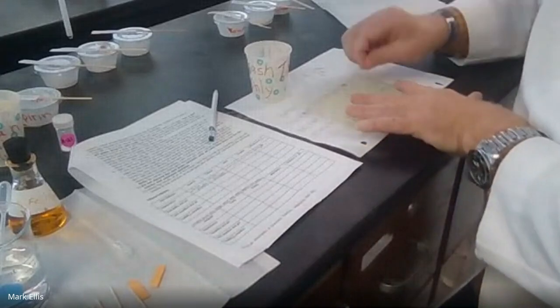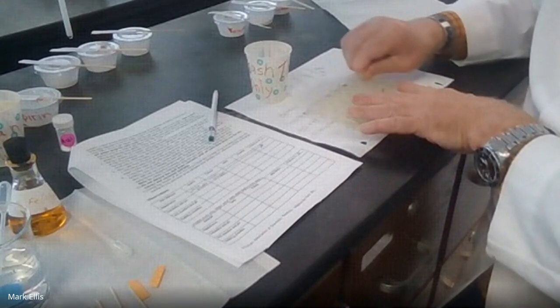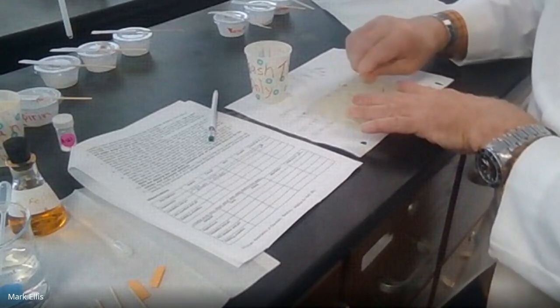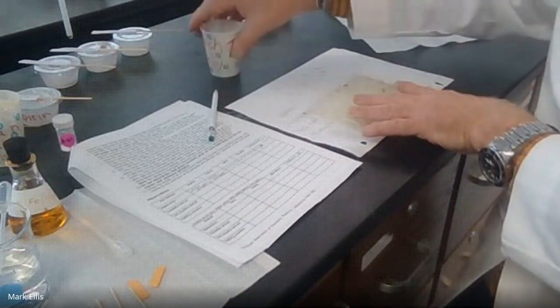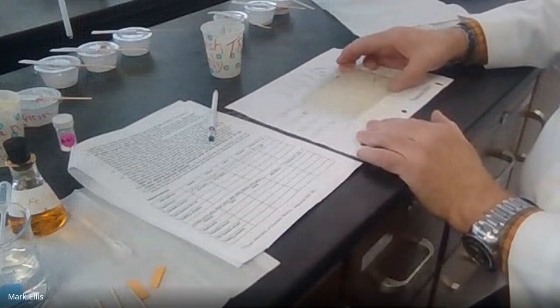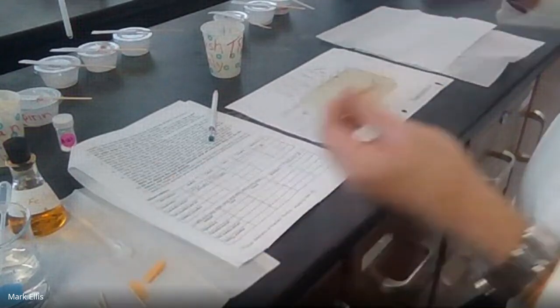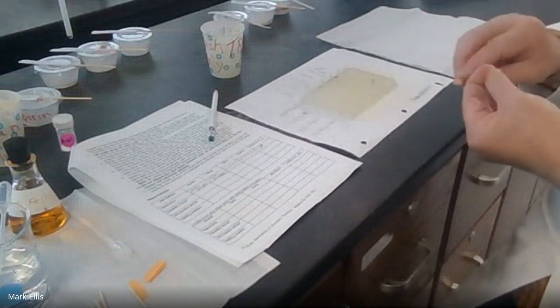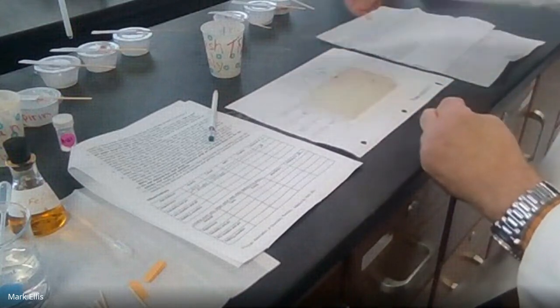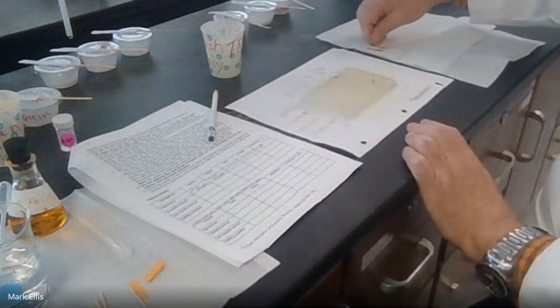And then the last one, this is my unknown. It's the 5th column, second row. Trash. Now we want to test the pH, and I would like to put the papers in the same order over here on my trash just so I can take a quick look at them. You just want to dip it in, put it to the side. Red is acid, blue is base. The regular color is neutral.